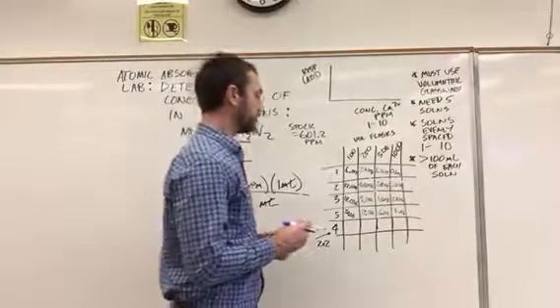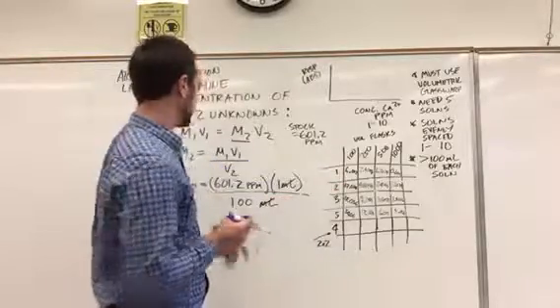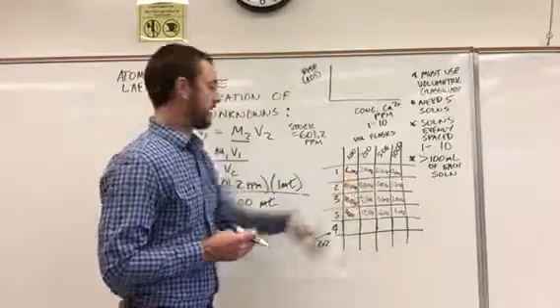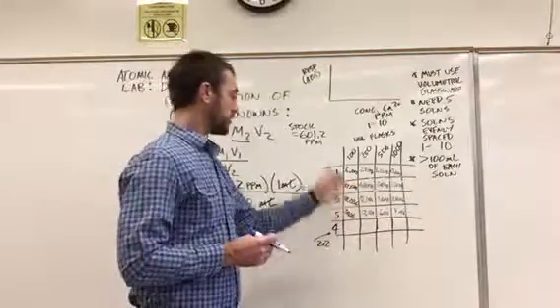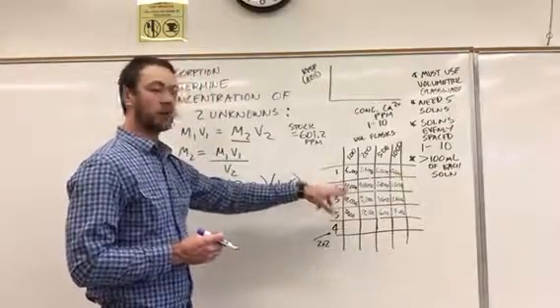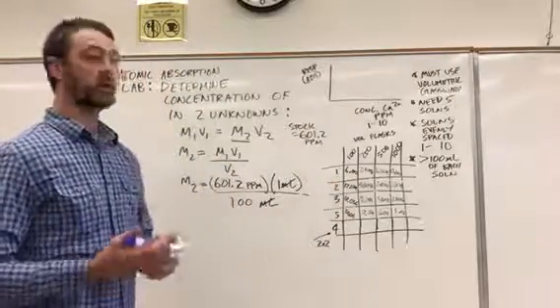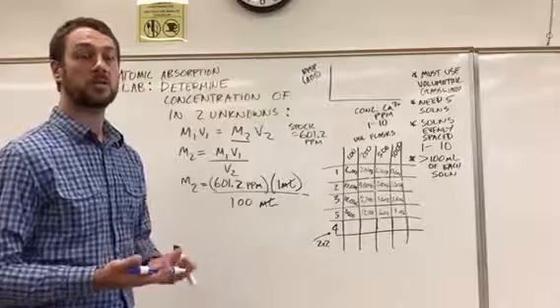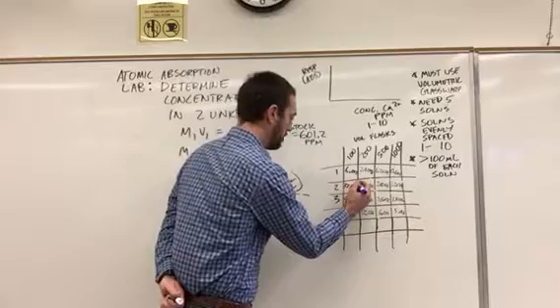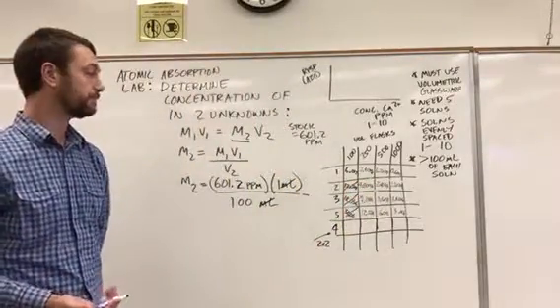The other thing that you'll notice is that there's patterns here, right? If I make a 1 to 100 dilution of 601.2, I end up with 6.012. And even if you round these to the nearest integer, you could see that if I double the volume, I'm going to double the concentration, which is going to give me a concentration of 12. And my highest solution should have a concentration of 10. So if I was thinking about what I was doing, I wouldn't have made these calculations because they're unnecessary, right?